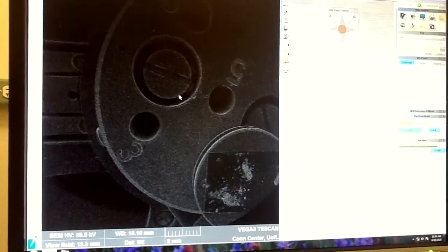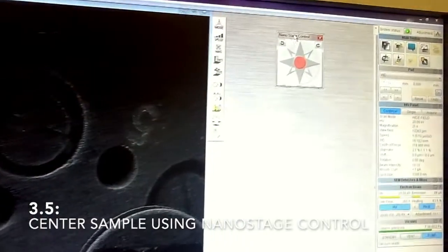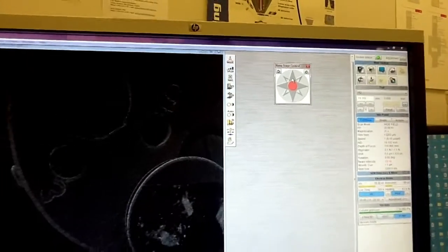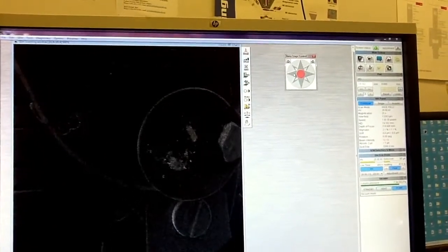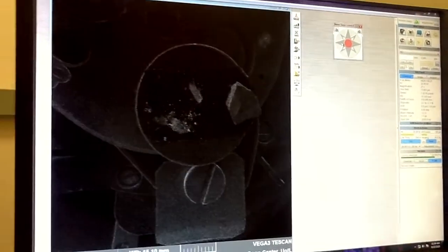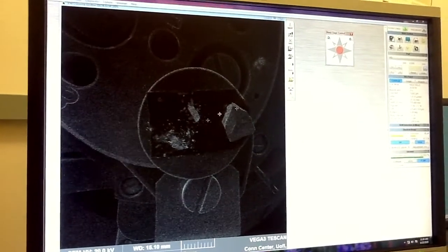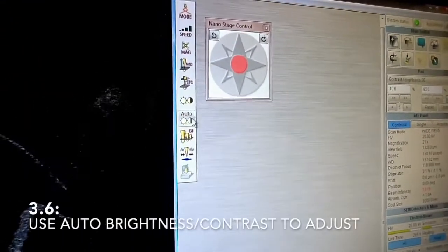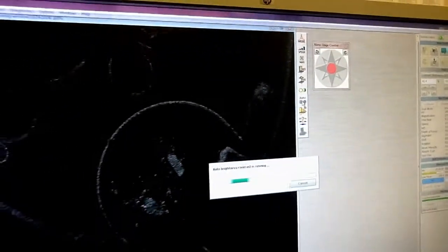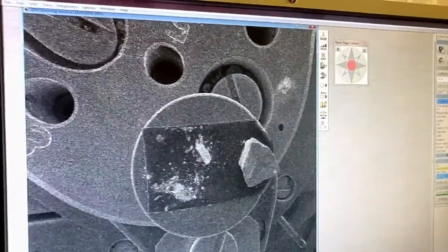We can see pretty much most of the stage now, with all the holes where you could have your sample. This is our sample — we want to bring it to the center. For this we will use the nano stage control, just by pressing this arrow you move it up, pressing this arrow you move it to the left. Position it approximately in the middle. If the contrast or brightness are not exactly as they should be, press this auto brightness button and it should equalize automatically. Now the conditions for imaging are good.